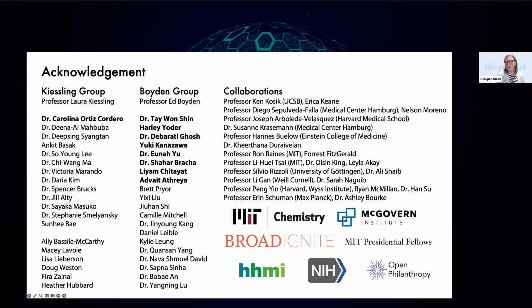Sarah asks, wonderful talk. Thank you so much. Would it be possible to visualize small membrane lipids such as PIs? Our lab recently has a lipid expansion paper, but I think that one used a lipid tag to visualize the lipid. To directly anchor lipid, you will need to optimize, for example, using an anchor that can react with certain lipid moieties to anchor them to the gel, but we haven't really explored in that direction.